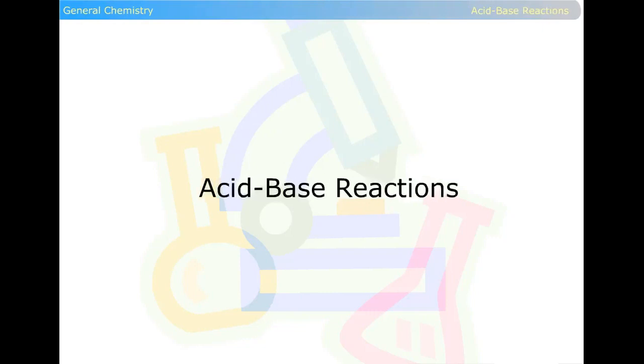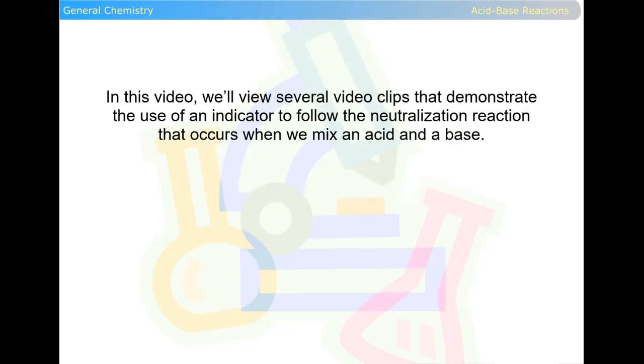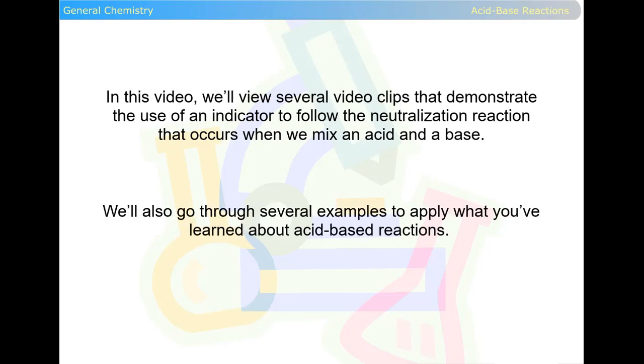Welcome to this video, Acid-Base Reactions. In this video, we'll view several video clips that demonstrate the use of an indicator to follow the neutralization reaction that occurs when we mix an acid and a base. We'll also go through several examples to apply what you've learned about acid-base reactions.